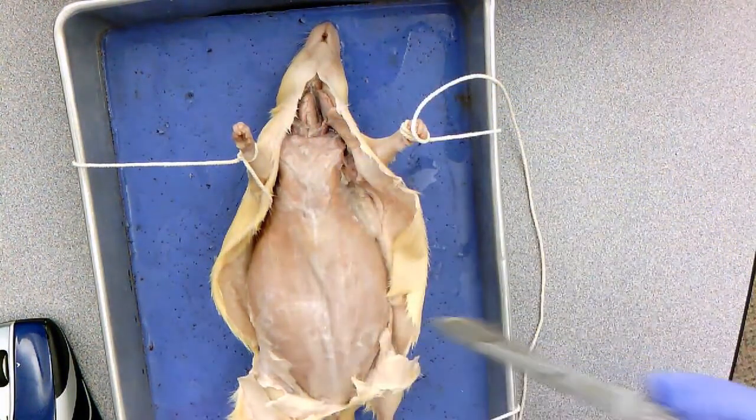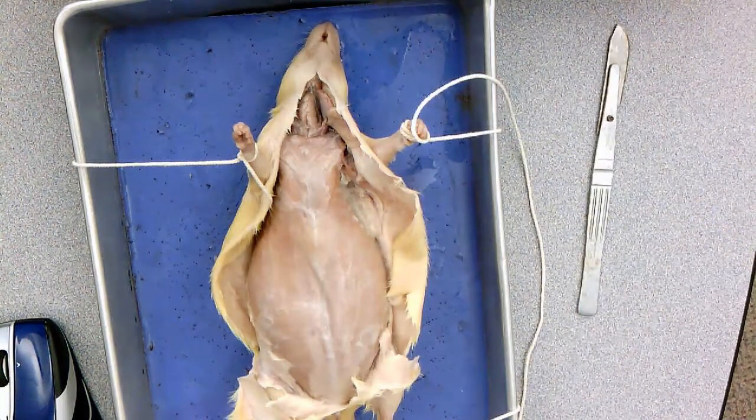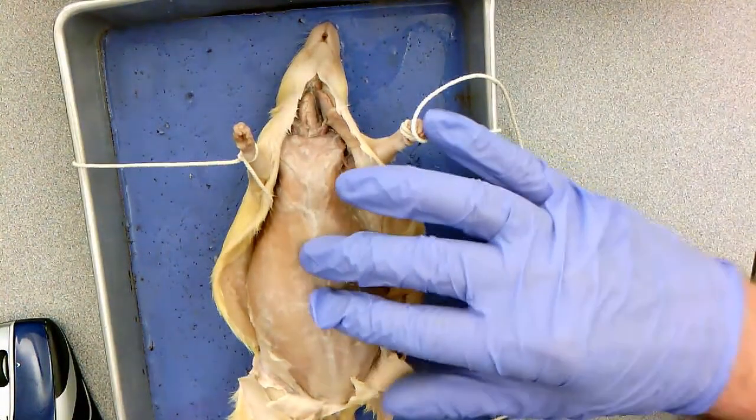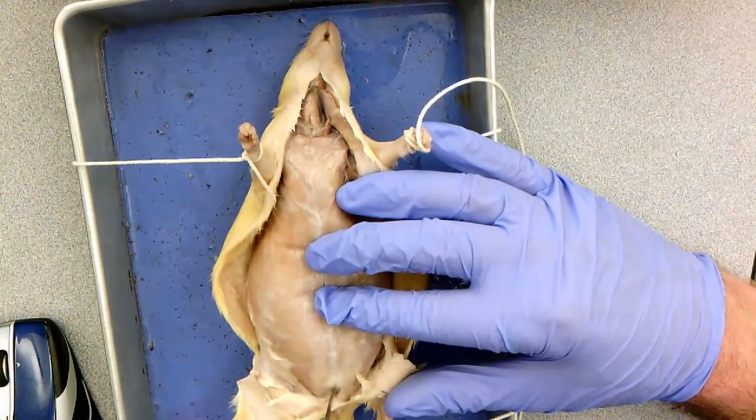Remember, we're dissecting the rat. We're not mutilating the rat. Dissection means to separate; mutilate means to destroy. We're dissecting the rat, not mutilating it. So you're just going to make a small incision down here in this pubic region. You're not going to go too deep.